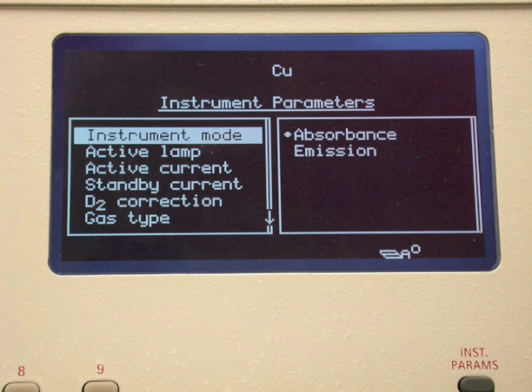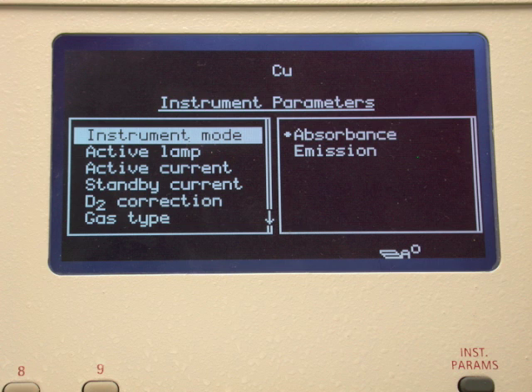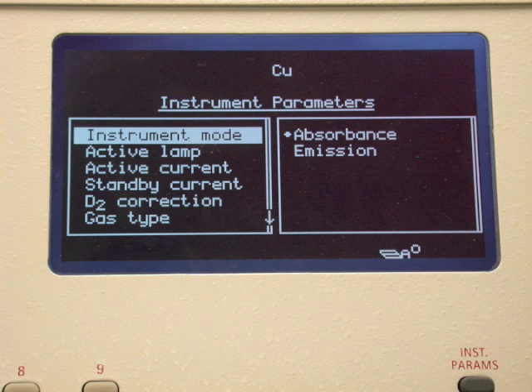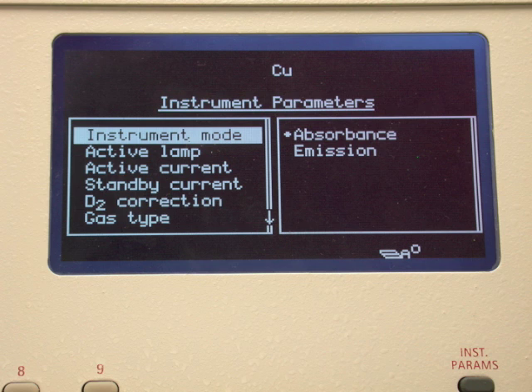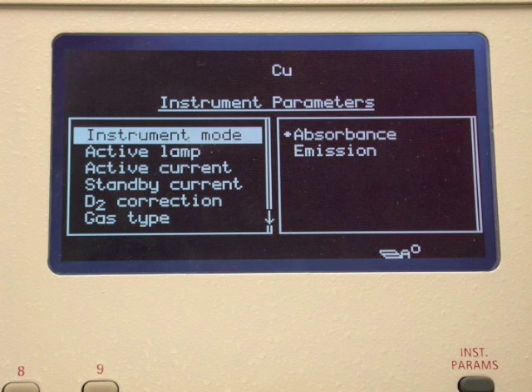The following screens are used to set important instrumental parameters. We will be operating in the absorbance mode for this demonstration. One can also operate in the emission mode. To make a change, use the right arrow key to move the highlighted region into the box on the right, then move up or down to the highlighted area of your choice and press the enter key to accept the operating mode.